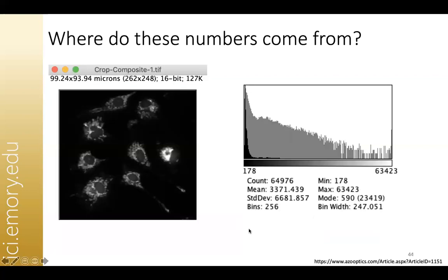So once we are clear with dynamic range, we can go back and try to understand one more thing, which is the image histogram, okay? What you are seeing in gray over here is the log scale of the same thing, which is not in log scale, shown in black over here. So if we look at this image histogram, this is a 16-bit image, right? So now you know a 16-bit image should range from 0 up to 65,000. And that's exactly what you are looking at. You are looking at some of these intensities, which are really, really high over here, and everything less than that.